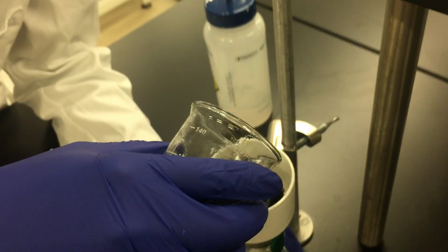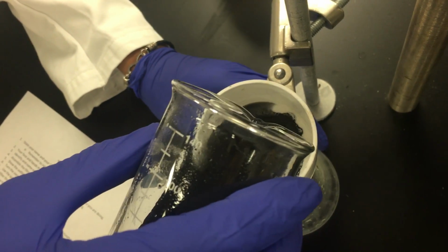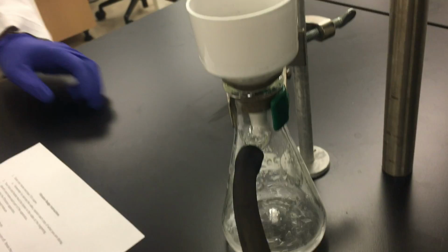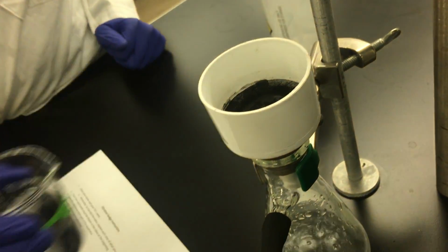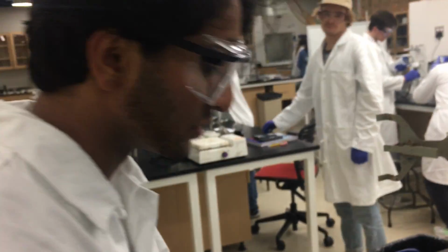As you can see, the filter paper is drying. That's due to the suction from the vacuum. That shows the filter, and there's very little of the solution left. There we go. So that shows the full process of the vacuum filtration. The filtration is finished. As you can see, the precipitate has dried.